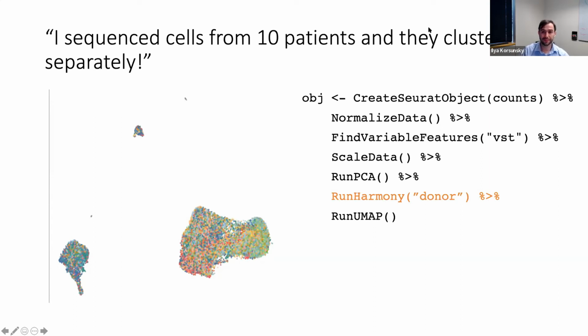That was it. Yes, there's another question that I don't understand so much, so I'll just read it. Is it possible to predict if I need to correct for batch effect in case I don't have the cluster assignment?